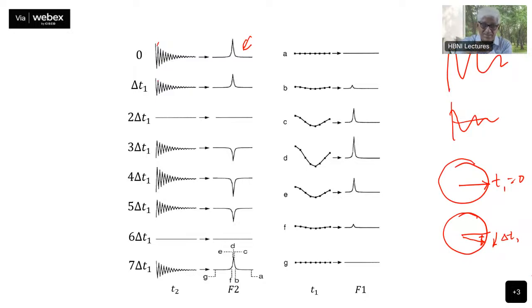And therefore, you will see this spectrum has a lower amplitude, lower intensity compared to this. You may have a third one where it comes down to 0, the fourth one which has gone to a negative value, the fifth one negative value increased, sixth one negative value further decreased, and then again 0, like this. So you see, your FID, the spectrum also keeps changing, the appearance of the spectrum changes as you increment the T1 values systematically. In this case, these are all absolute value spectra. These are not phase sensitive spectra, but it doesn't matter. It gives you the concepts clearly.